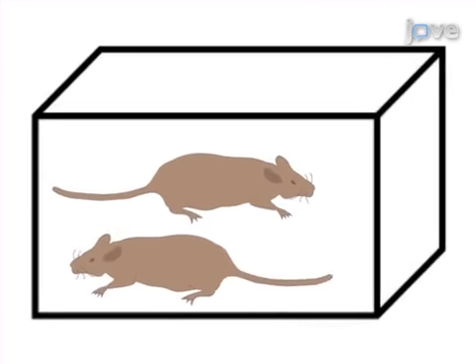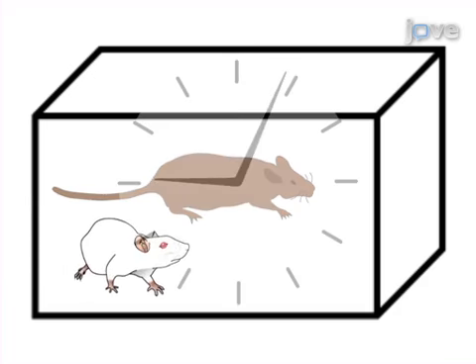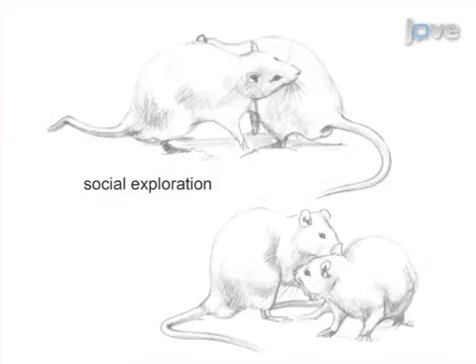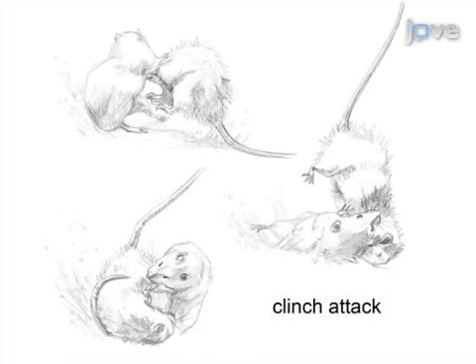Next, the companion female is removed from the cage. When ready, an unfamiliar male rat is introduced into the cage of the resident male, and they are allowed to interact for 10 minutes. Ultimately, the procedure is aimed at the establishment and maintenance of a territory by the resident male that he is willing to defend against intruders.